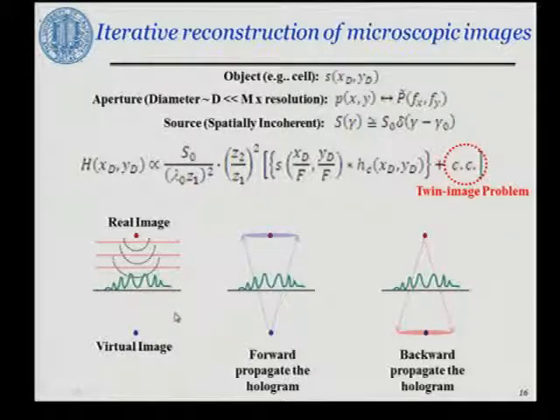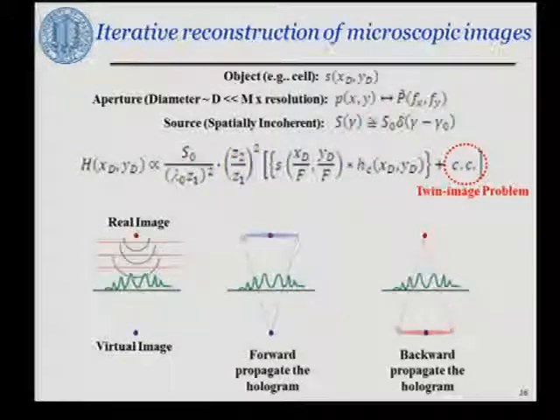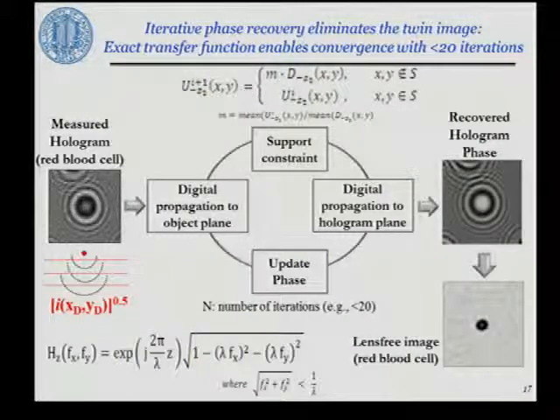Another way of looking at this is actually purely from the perspective of sampling or measuring a field's amplitude that is missing phase. So you can purely look at this framework as a phase recovery problem and try to find the phase of the optical field whose amplitude we've measured. And this is a better framework for some of the work that we do, and we'll stick to this one, and I'll show you some examples of how we do this.